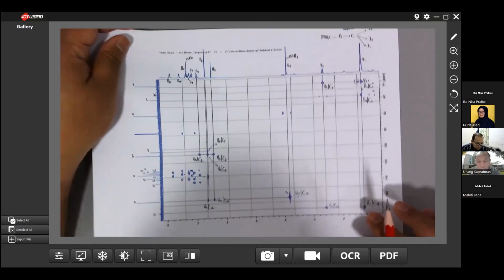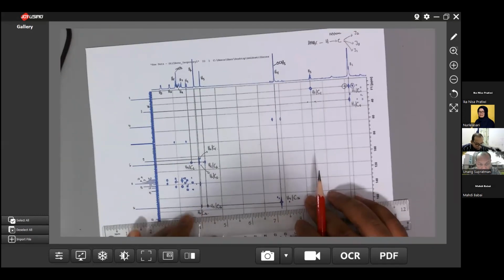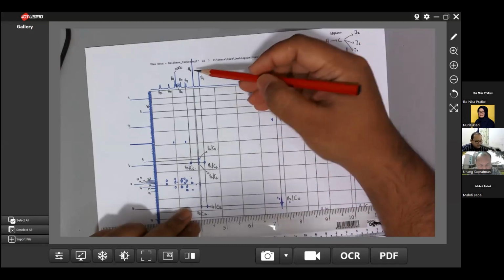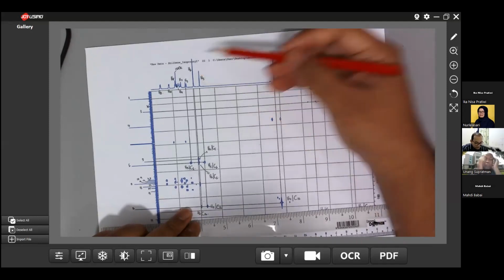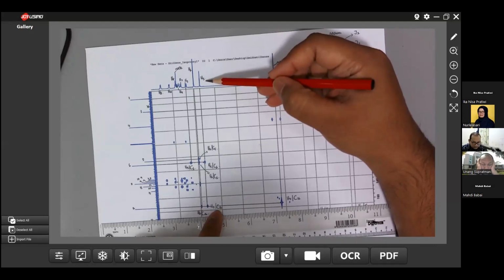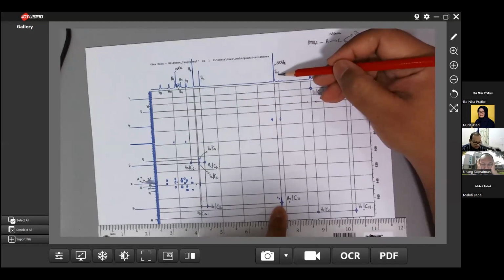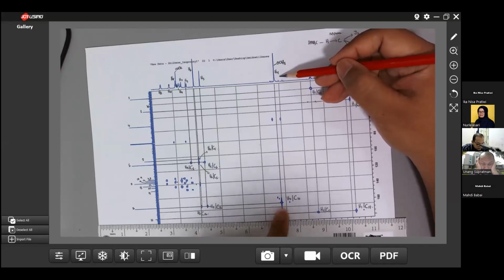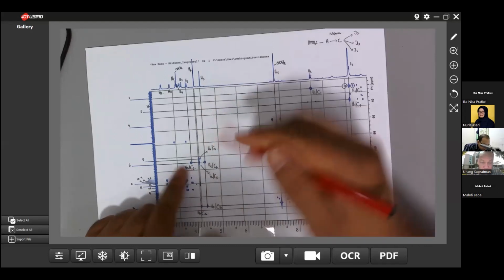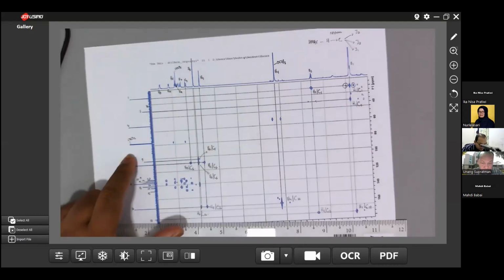Next, what we can do is carbon number 16. 16 can see proton number 6. Carbon number 5, proton number 5 can see carbon 16. Number 4 can see carbon 16. Again, next, find the simplest one. This one is CDCl3, and this one is also CDCl3. It means the center of this one.